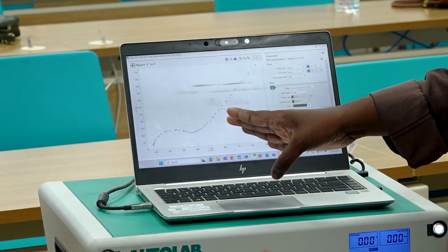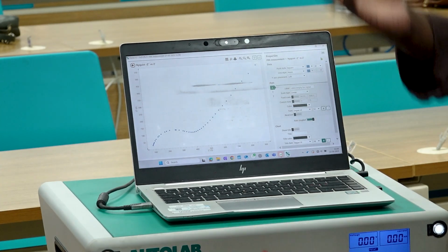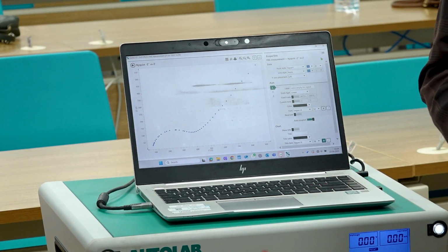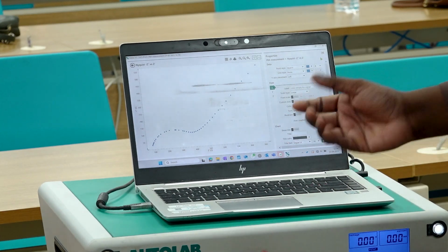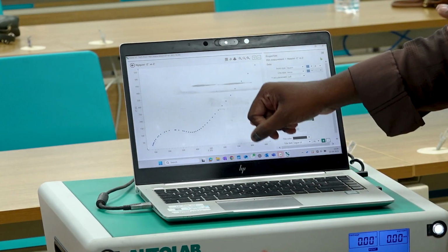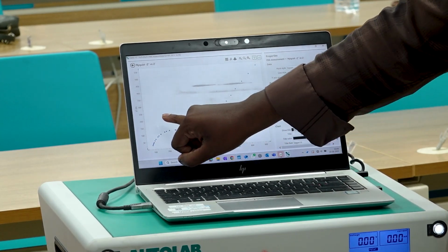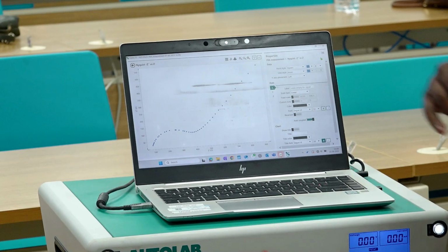The line is straight or flat or diagonal or perpendicular? Okay, but you just know that, the same semicircle here also is there. So internal resistance, charge transfer, double layer. After the semicircle, whenever you are getting this 45-degree line, this is very important.